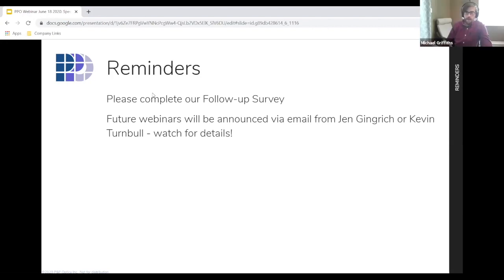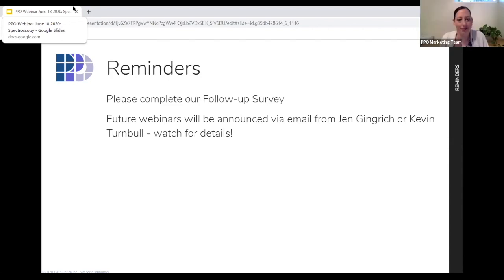So thankfully, we haven't had to do any replacements on spectrometers yet, but the initial install of the detector modules is fairly painless: lift it in, secure it with a few fasteners, and then do the optics test to make sure that everything is working properly and talking to each other nicely. The lamps are straightforward too. For each lamp, you just remove 2 bolts, and that's the only tool you need, and then they lift out of the cradles quite easily. Awesome. So it's just a very short process.